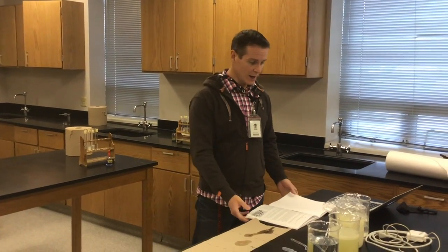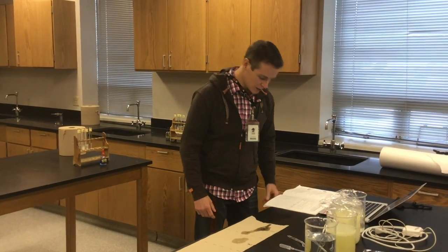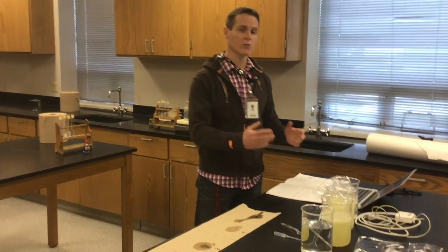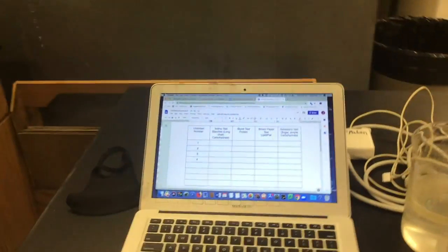So we're going to go ahead and get started, and the first thing I want you to draw your attention to is on page 65, a little data table. That's where we're going to record our data, and Mr. Kesey's going to come around and show you. I'm going to point out a few things.